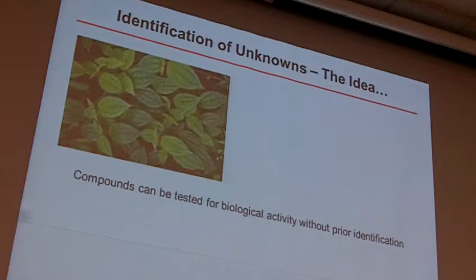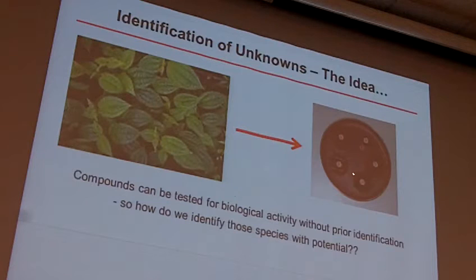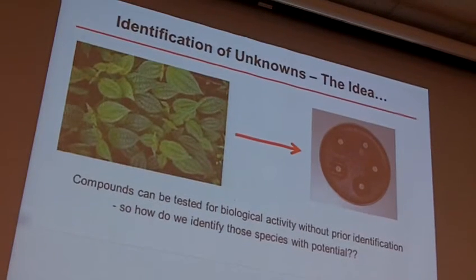I mean, in its very crudest form, you can take this plant here, chop off these leaves, grind them up, and put them into a petri dish with some bacteria. You see something like this, and look, we have these places where we dotted it, and we killed all that bacteria around it. There might be something interesting there. Now you have to find out what it is.